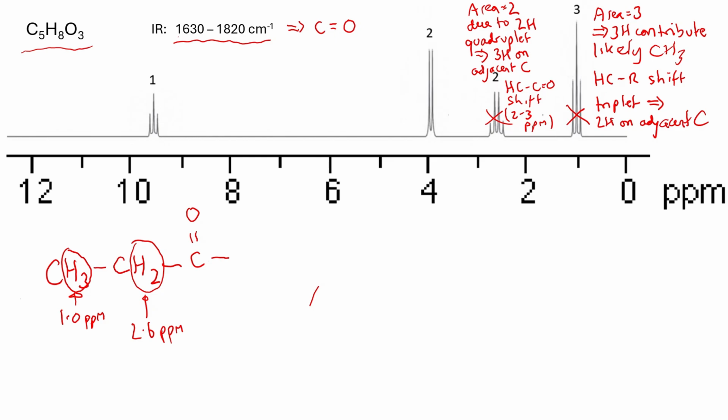So what do we do now? Well, we have got 2 more peaks to interpret. We've got a bunch more carbons and hydrogens and things to interpret, but we can't directly work out what's on the other side of this carbonyl group because we've got no hydrogens on there, so we've got no information directly about what's next. So we're going to just leave that bit of structure where it is for the moment and then join it on to another bit of structure that we're going to deduce by looking at these remaining peaks. Okay, so we just keep that documented, ready to build into a bigger structure in a minute, but now we're going to start looking at these 2 peaks.